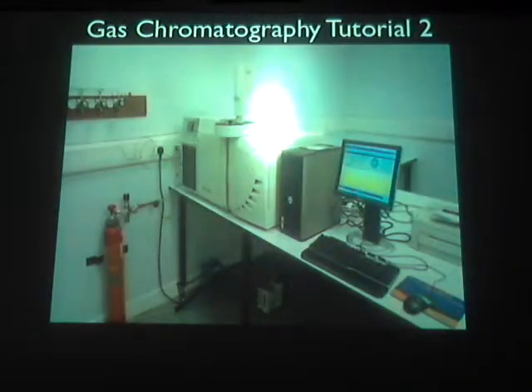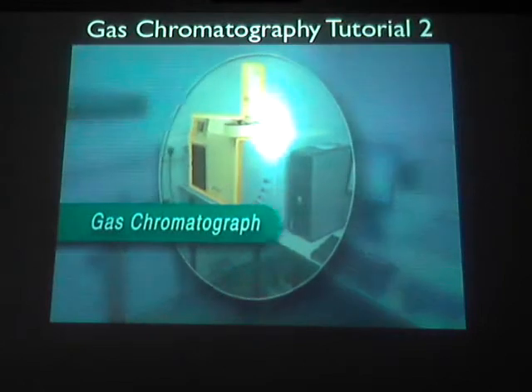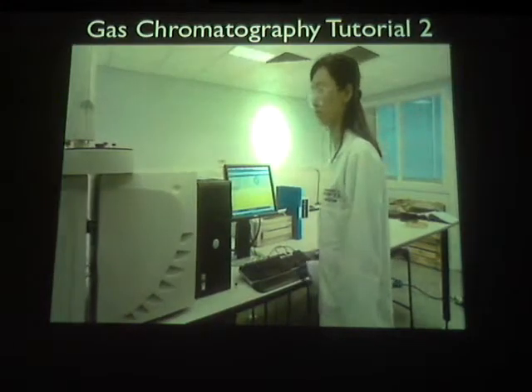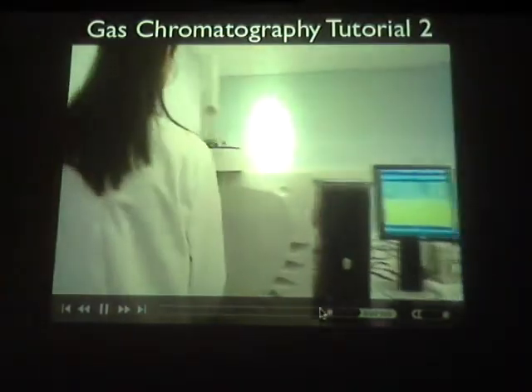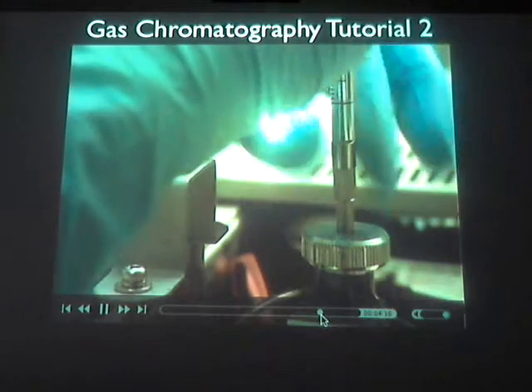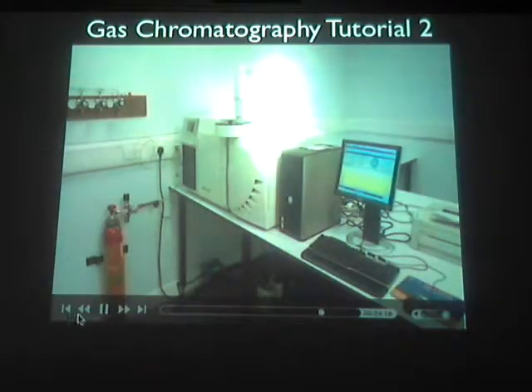In this alternative instrument, the gas chromatograph is on the left, and the detector is a mass spectrometer, which runs the mass spectrum of each component as it comes out of the column. It can be particularly useful when analysing an unknown mixture, as the mass spectrum can help to identify each component. This guy here to the right, he is a mass spec. Basically, he can identify what it is based on its composition, what it's made of.